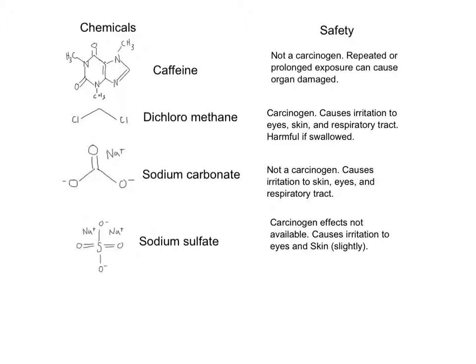The compound of interest in this experiment was caffeine. It is not a carcinogen, however, repeated or prolonged exposure can cause organ damage. Dichloromethane was also used in this experiment. Dichloromethane is a carcinogen. It causes irritation to eye, skin, and respiratory tract. It can be harmful if swallowed.